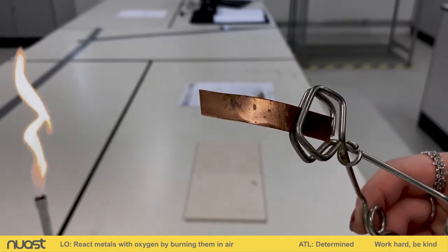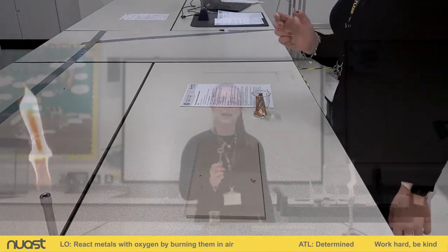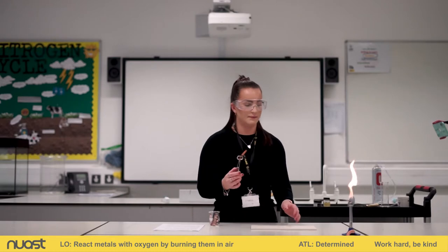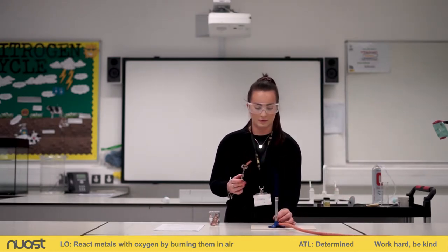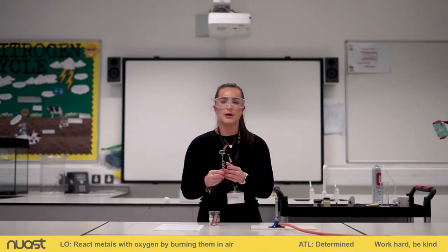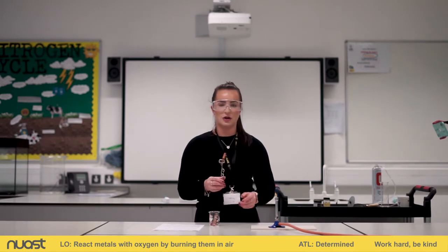You can see it's quite a shiny piece of copper there. We're going to see how it looks once it has been in our blue flame, our hot flame, for roughly 30 seconds. Okay, so I've got my blue flame now, and we're going to see what happens once I've put this copper in there for roughly 30 seconds or so.